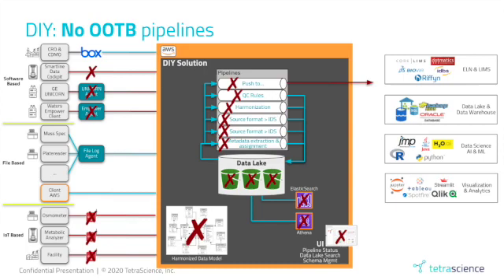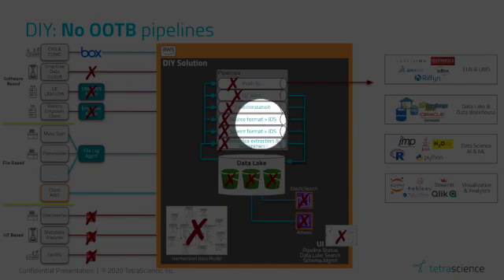And then we also have to think about, as I'm pulling data in, I'm going to need to format that data. So whether it's a Wyatt Astor report that's coming in a PDF format, where I would need to translate that PDF to a common format or our harmonized format and put it in the lake, I would have to write that. I would have to write the metadata extraction and assignment algorithms to pull that metadata out of the files that we're reading, or out of the systems we're reading, and put that as metadata tags on the actual assets in my data lake. I would have to write the harmonization rules, the QC rules, all of that I have to write. They give me tools to do it, but you would have to write it.